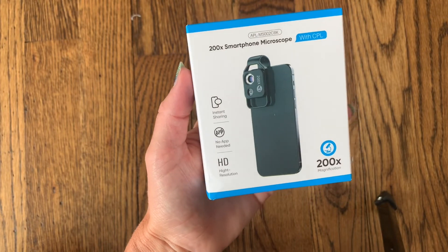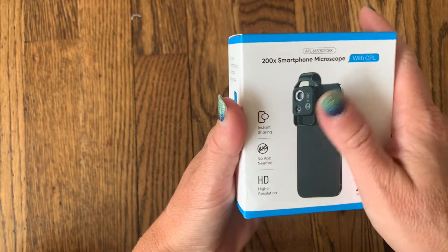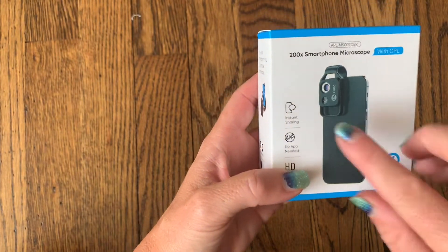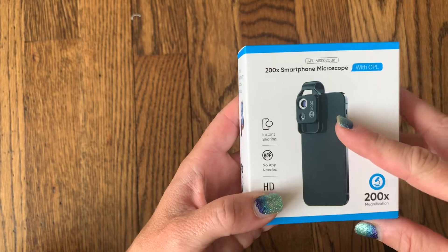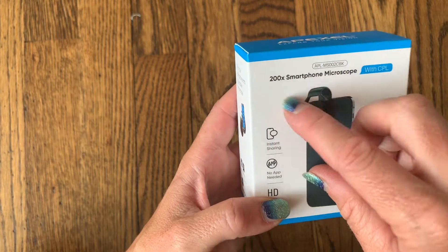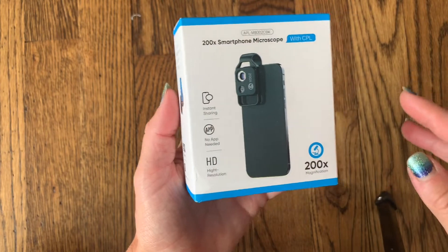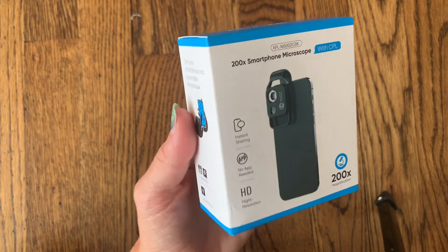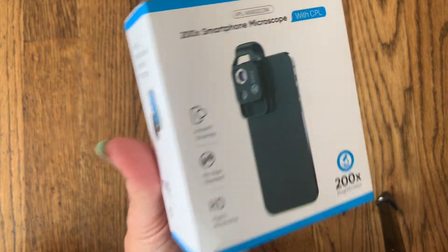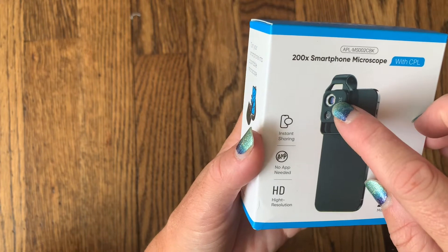Hi everyone, I just got this brand new smart microscope and I'm really excited to test it out. It connects to any kind of phone — whether you have an iPhone, Android, or whatever — and it's going to work with your phone and really magnify anything you want to look at. It actually has 200 times magnification, so you can get super zoomed in on anything outside, inside, anything you really want to look at under a microscope. This is going to help you — it has very high resolution and there's no app needed at all.